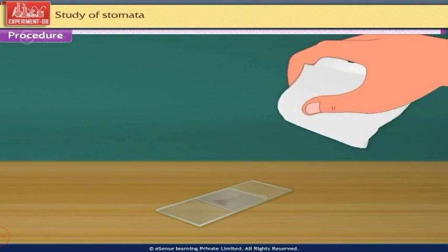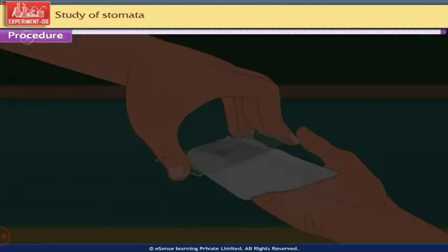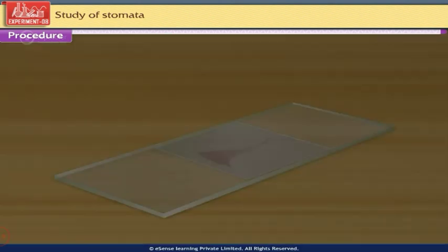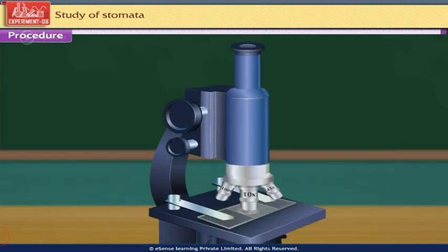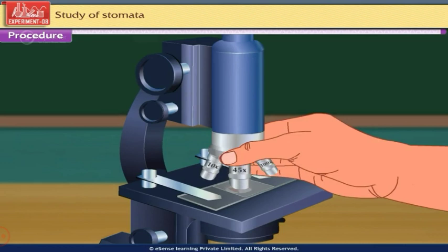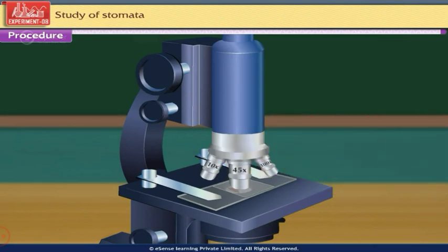Remove the excess stain and glycerine with the help of blotting paper. This is a temporary mount of a dicot leaf. Observe this temporary mount first under low power and then high power magnification of a compound microscope.